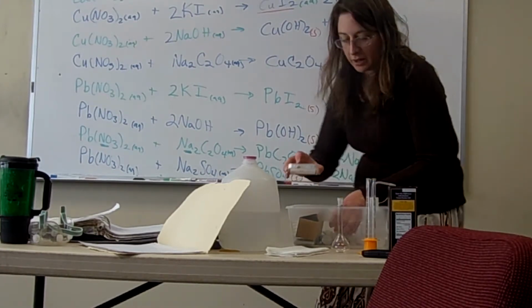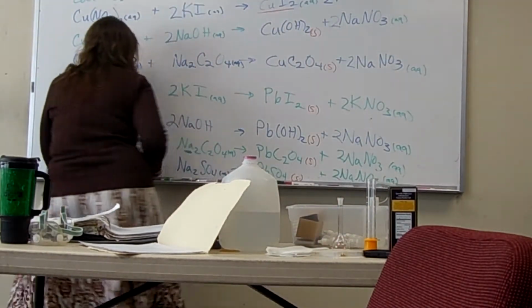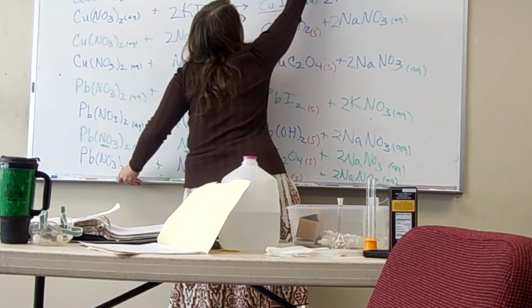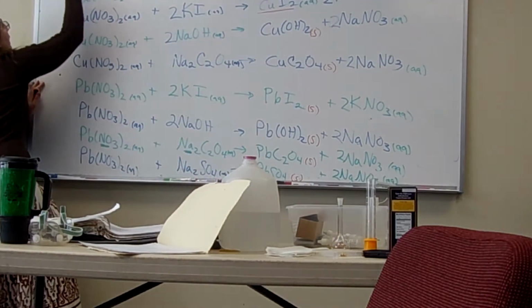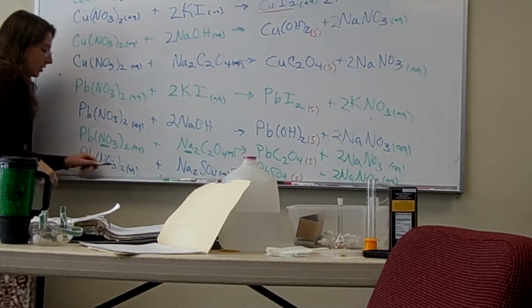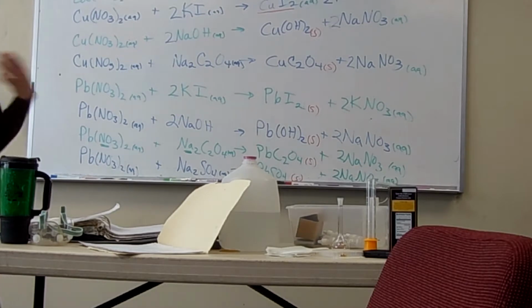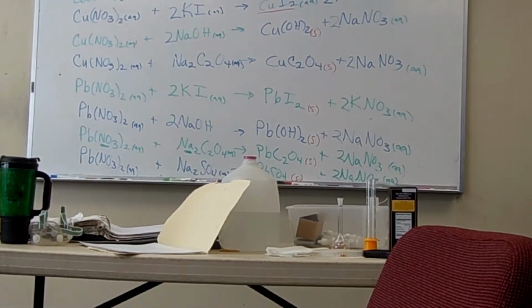So if we had done all of the mixtures that the first page called for, we would have found some, like that one. So, in this case, there was no chemical reaction. If you mix two things that are aqueous solutions together and all of them are soluble in water in any combination, they just stay dissolved.